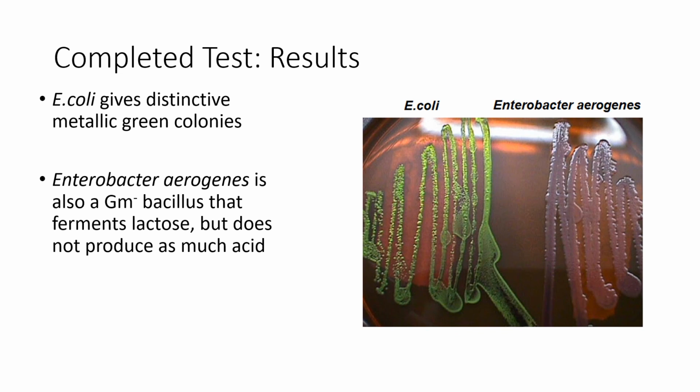So once again, I'm looking at EMB here, which has two special dyes that react specifically with E. coli. Remember that EMB agar has two sets of sugars, lactose and sucrose. And remember, sucrose is a disaccharide. So is lactose. There's actually, really technically 4 monosaccharides in there, right? And so there's a lot of fermentable ability there. And so E. coli will give you a lot of acids from that, giving you this metallic green. Other organisms don't.